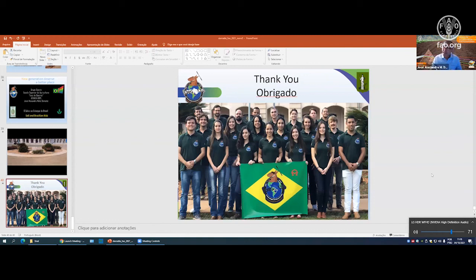Okay. I need a little time to respond to that, because I know how to respond. The point you have to think about is spectral libraries. We will have a world spectral library. Okay, we will have it. And we will already have the Brazilian one. So if you have a sample in the Philippines and want to use my model, you can use it and you will see the error. If you want to use the world one, you can use it and see the error. But at the end, these services will be chosen by the user.